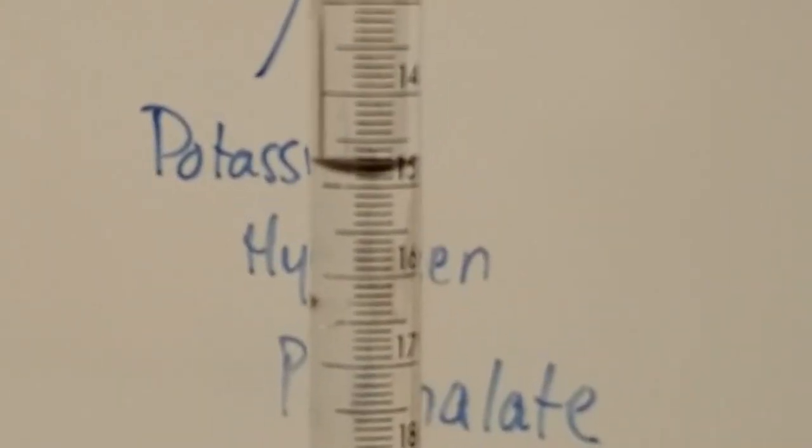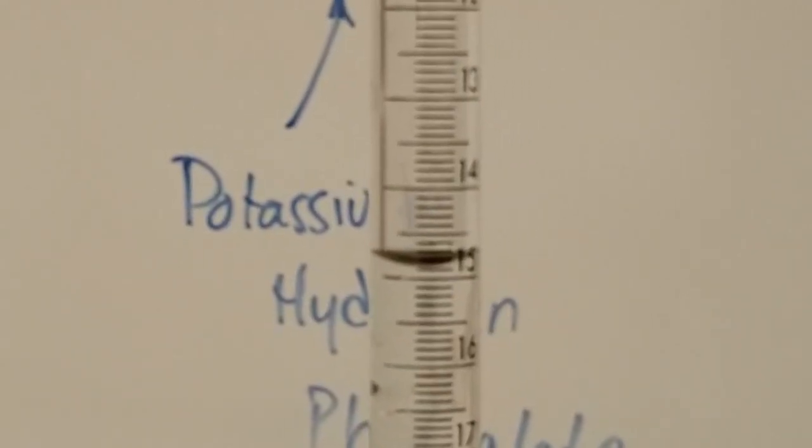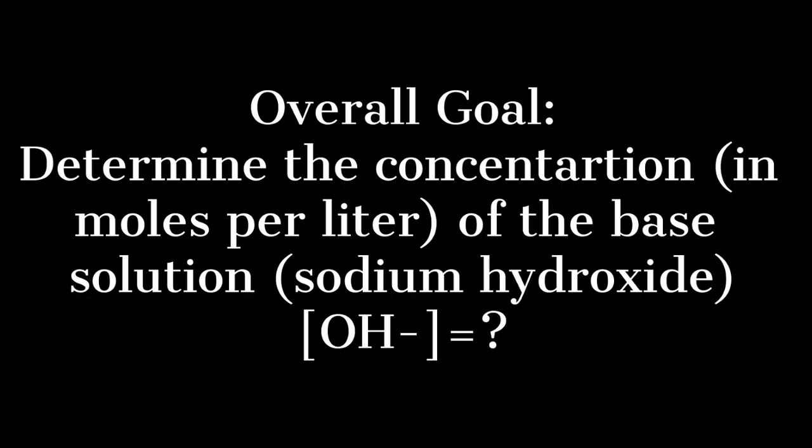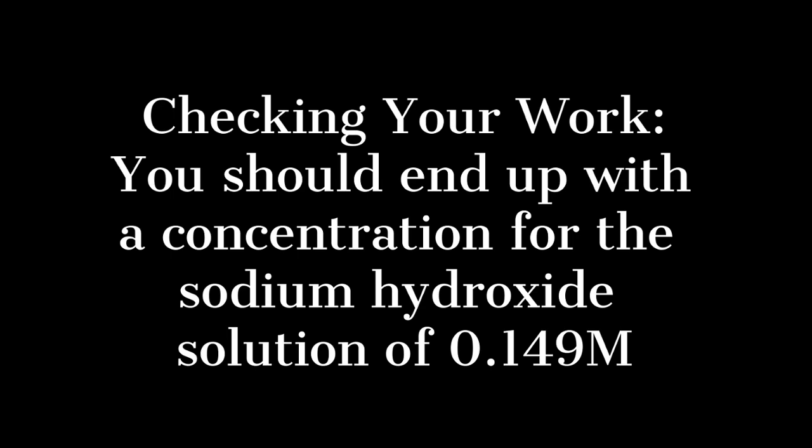There's the bottom of that meniscus and it looks to me to be all of 14.9 and just past the 9 a little bit. Maybe 14.91 would be the correct reading for this volume.